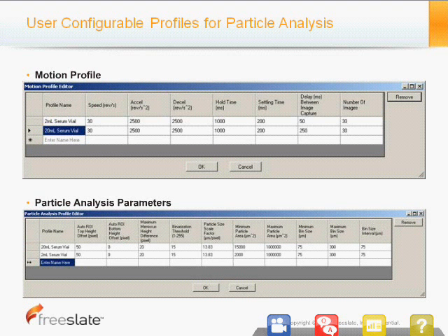The binarization threshold is the particle detection threshold that I mentioned to help reduce noise. There's a particle size scale factor, in order to convert from the size of the pixels of blobs that are found to an actual particle size. And then you can restrict the range of particles that you're looking for.